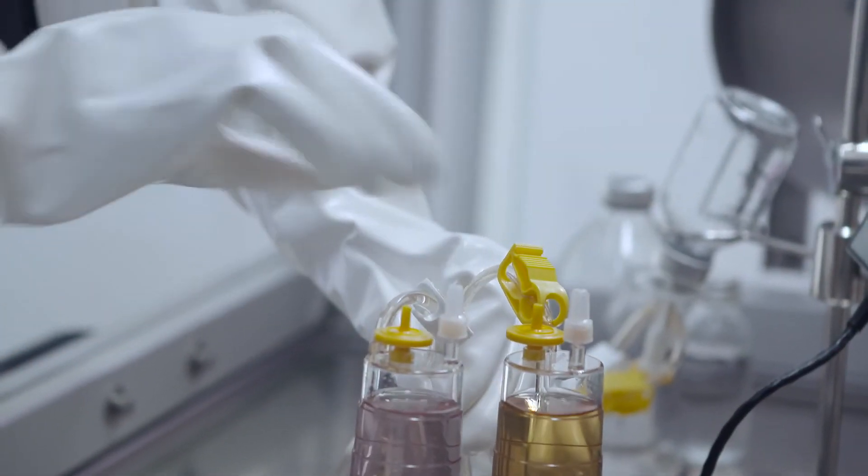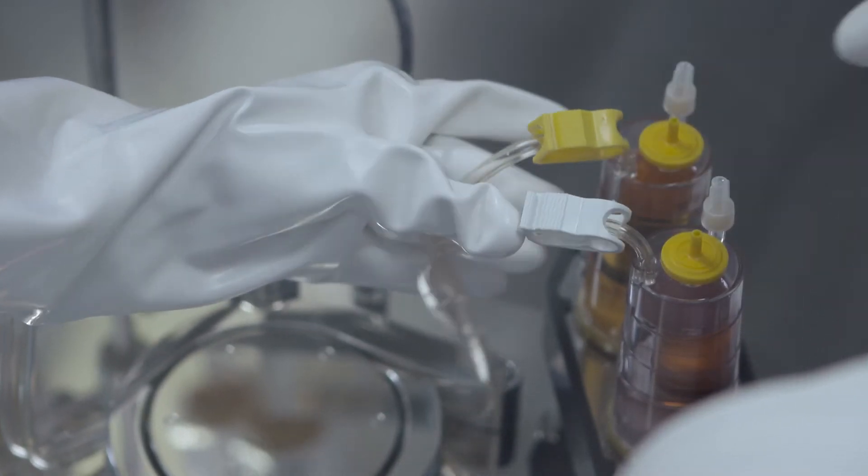Large pre-installed and color-coded clamps for increased process security.